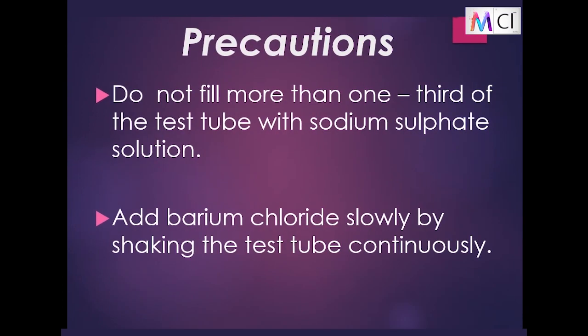Precautions. Do not fill more than 1/3 of the test tube with sodium sulfate solution. Add barium chloride slowly by shaking the test tube continuously.